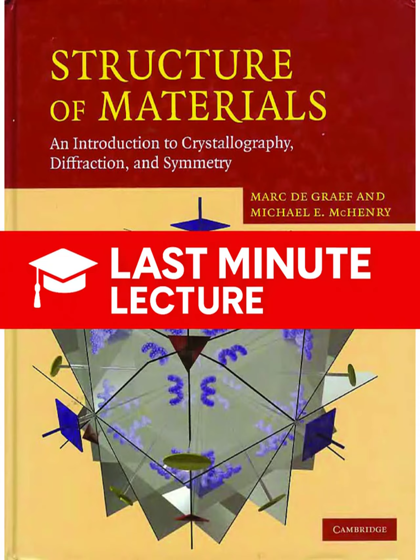And the second method is reflection Laue. In reflection Laue, the detector is placed in front of the crystal. The beams reflect back toward the source side. This is for thicker or more absorbing samples. In this case, spots belonging to a common zone are arranged along hyperbolic curves. The pattern is a direct visual map of the crystal symmetry.